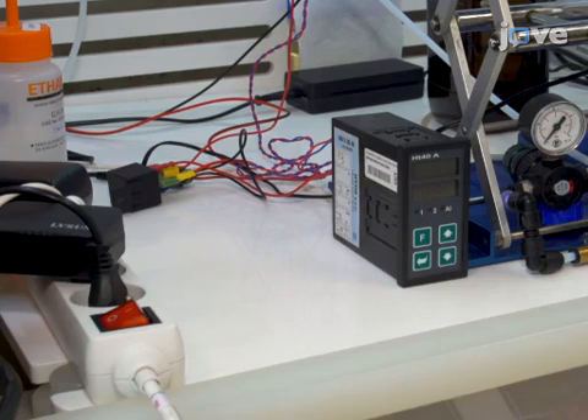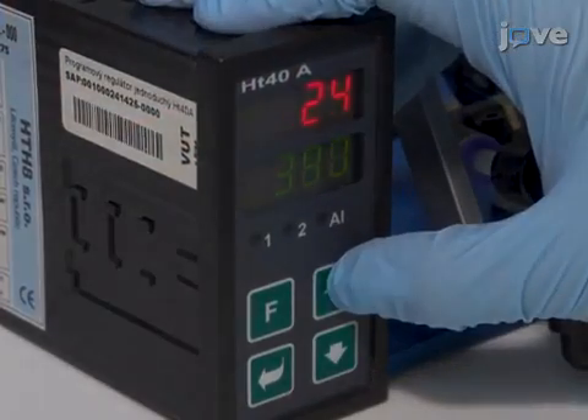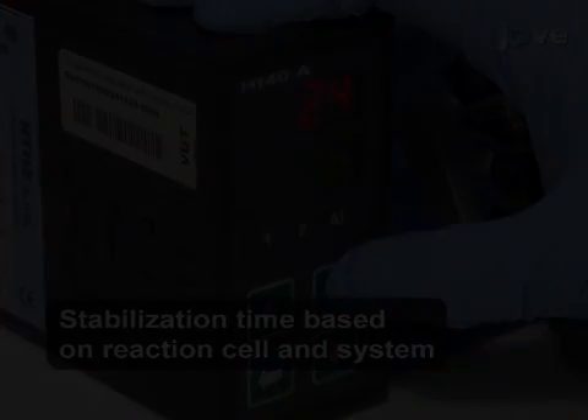Next, turn on the temperature control system consisting of resistive heaters integrated with the reaction cell, a thermocouple to sense the temperature of the substrate, and a proportional integral derivative controller. Set the temperature to 400 degrees Celsius and allow it to stabilize for approximately 2,000 seconds.